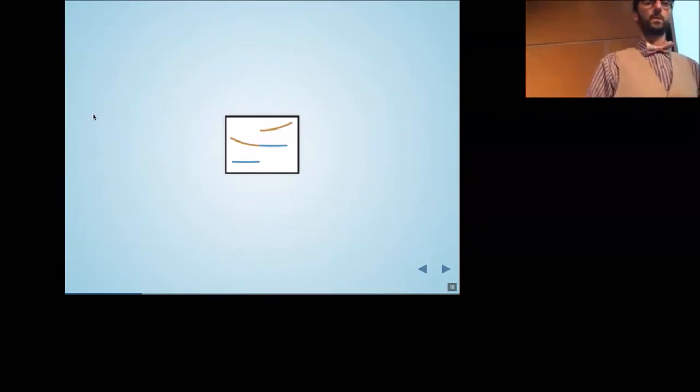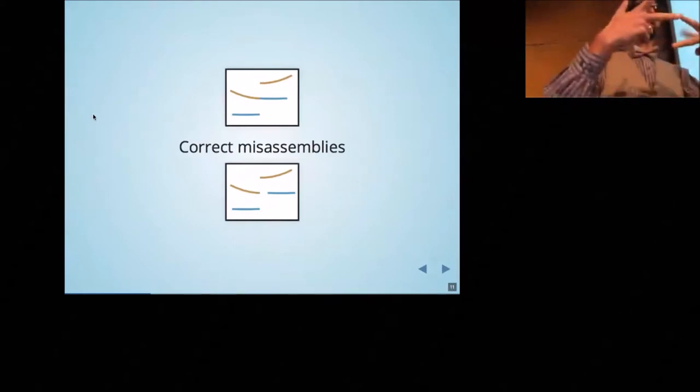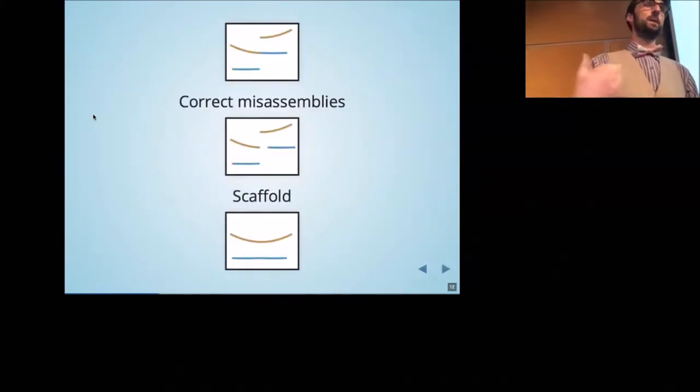No amount of scaffolding is going to fix this situation when you have that misassembly there between the yellow and the blue. First we have to correct that misassembly by breaking that yellow-blue chimeric contig into its two correct components. Once you've done that, now you can scaffold the assembly and finish it—put the yellow with the yellow and the blue with the blue. But as long as you have that misassembled contig in your assembly, you're never going to get to that point.